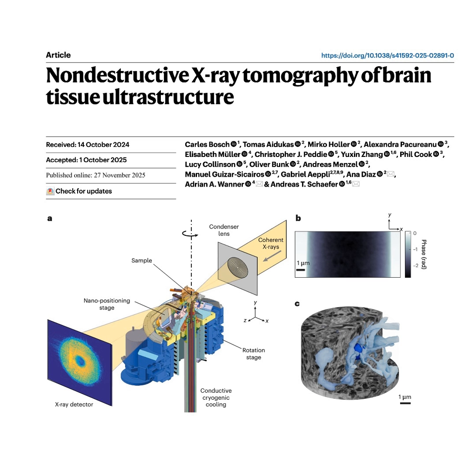Sub-20 nanometer in a whole brain volume? I mean, that's a revolutionary concept. That's bringing EM-level detail to the scale of an entire organ. It is, and they're already exploring variations. They mention things like laminography, which is an imaging geometry that lets them image flat, millimeter-wide slabs of tissue. It could potentially offer even greater efficiency and resolution.